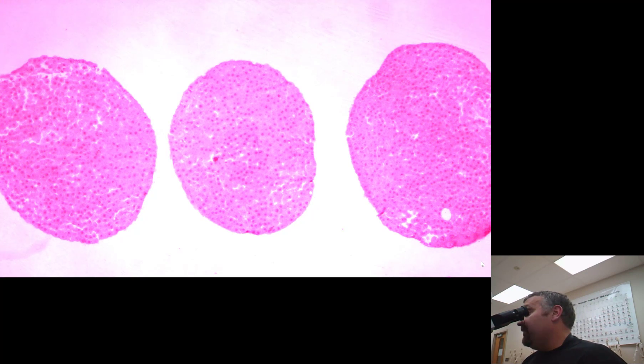Here we're on the scanning power, the 4x objective, total magnification of 40 times. I have done my Goldilocks to try to make sure it's as focused as possible.